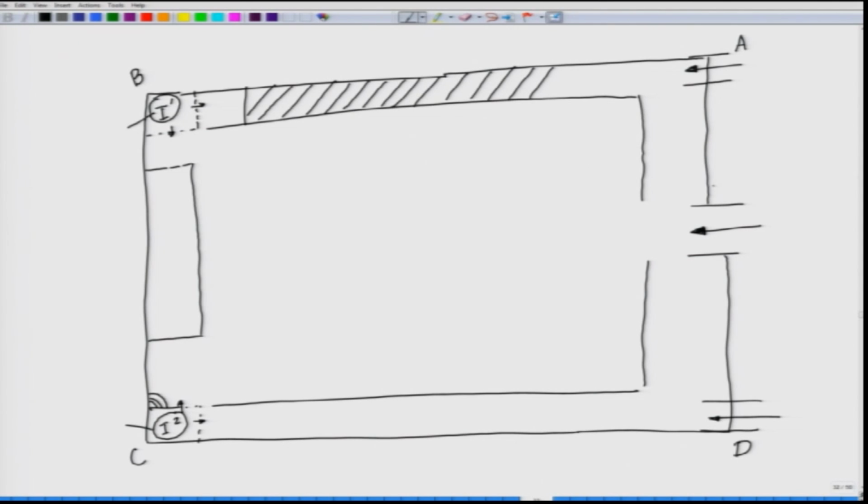We talked about how just outside the door or somewhere out here you will have the place for the extra cylinders, which should be tied up or kept in proper frames so that they do not fall down, and you need a cylinder trolley to carry the cylinders inside and outside. Prefer to follow something like this: if you take the cylinder to this spot, follow one track, and do not mess up the center of the lab, the whole surface area you have.